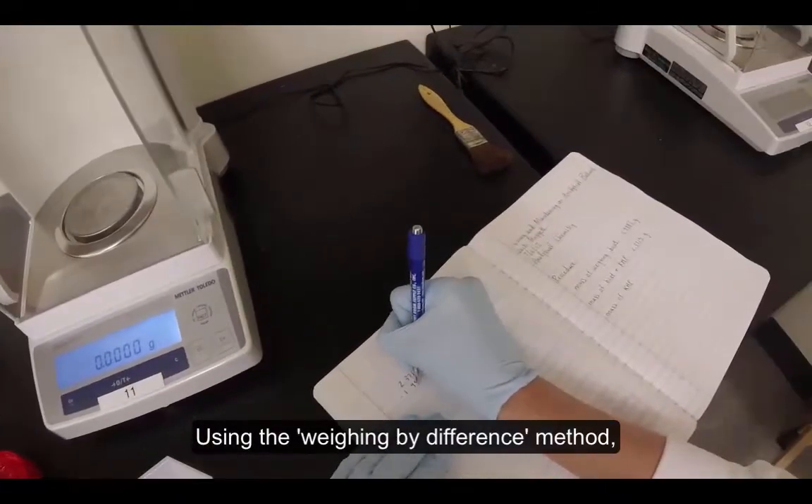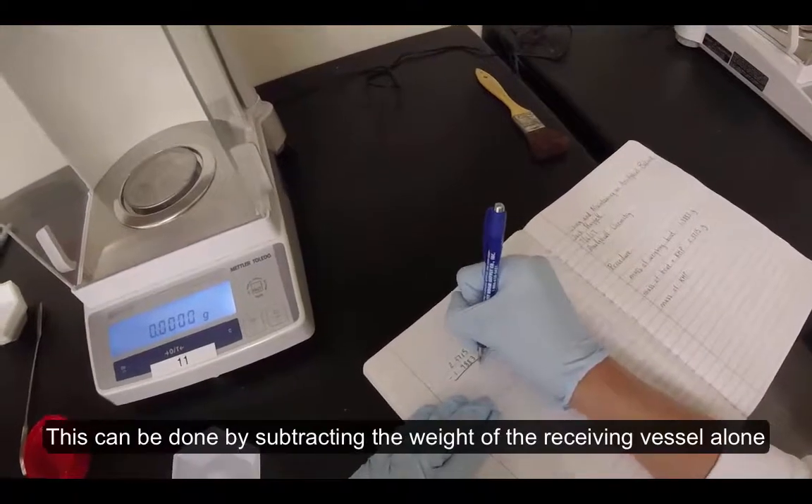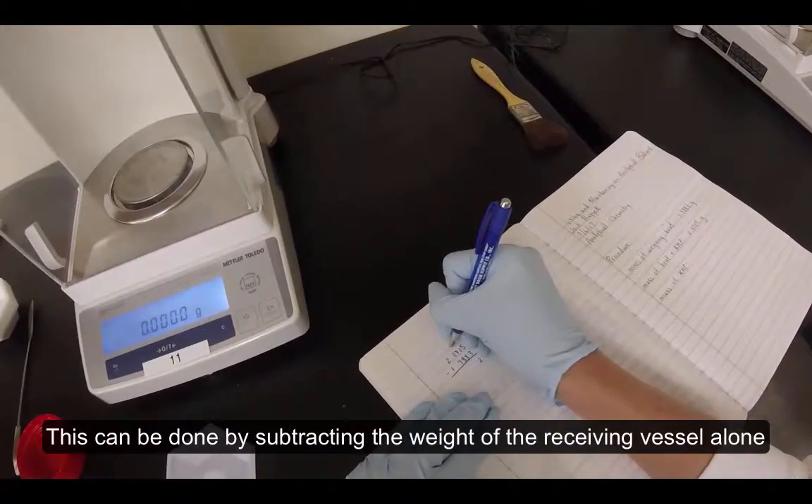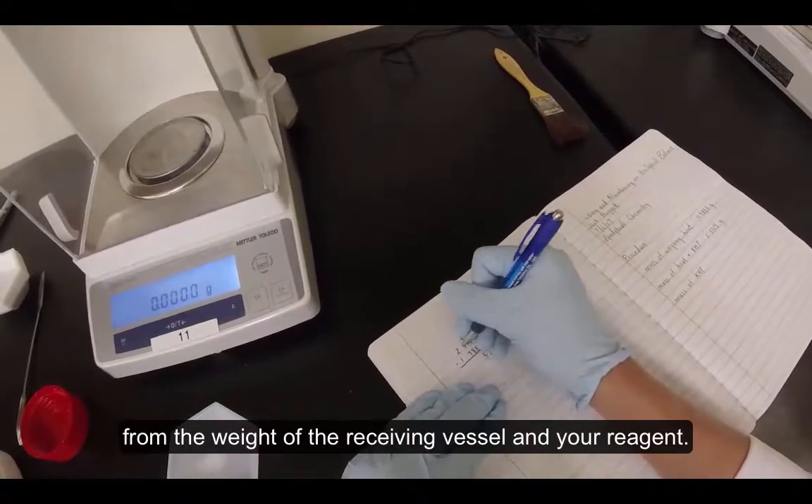Using the weighing by difference method, determine the weight of reagent that you just weighed. This can be done by subtracting the weight of the receiving vessel alone from the weight of the receiving vessel and your reagent.